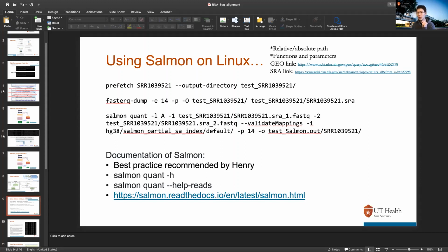is a good option. I have a few more slides after the hands-on session to quickly introduce other alignments, or how other huge consortiums do alignments. Traditional alignment takes time, but it provides much more information, like the chromosome locations. And if you want to do fusion detection, or call mutations from RNA sequencing, as some people do, you couldn't call mutations using Salmon. But if you align back to the reference genome and you see a single base where your reads differ from the reference, then you know there's a potential mutation there.